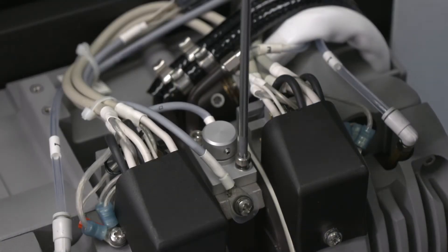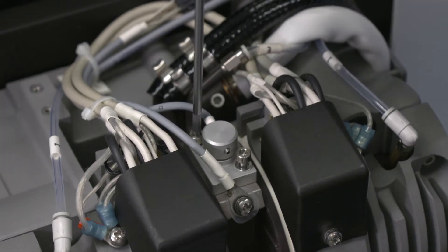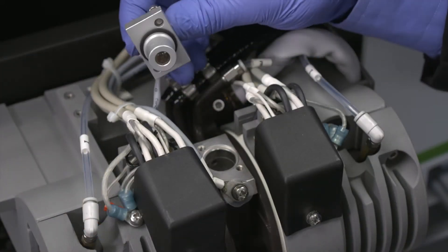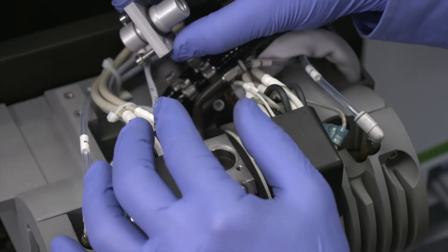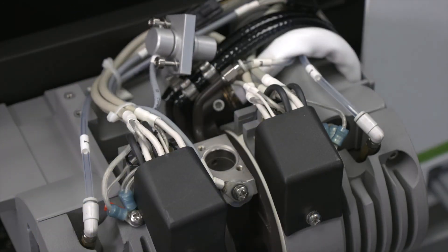Using the torx driver, unscrew the two captive socket head screws that secure the optical sensor to the rear contact housing. Carefully pull the optical sensor out of the rear contact housing. Make sure you do not damage the o-ring and move the optical sensor to the side.